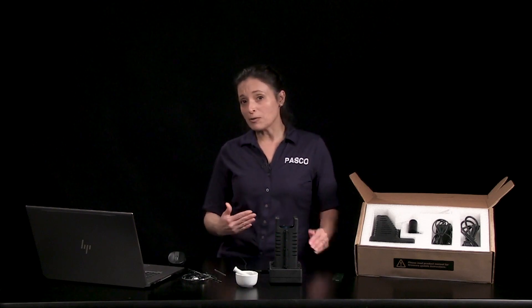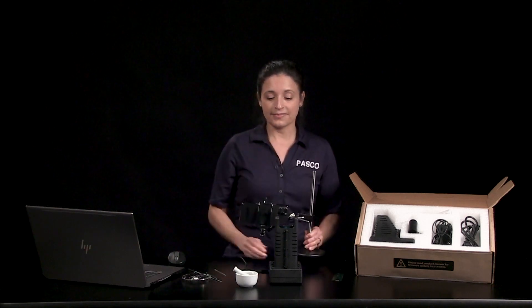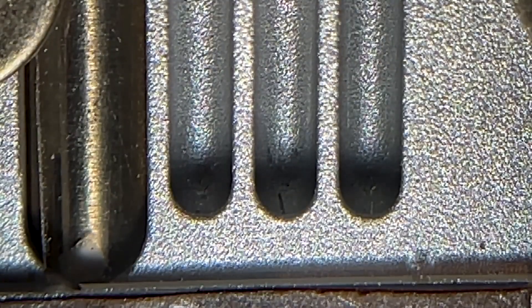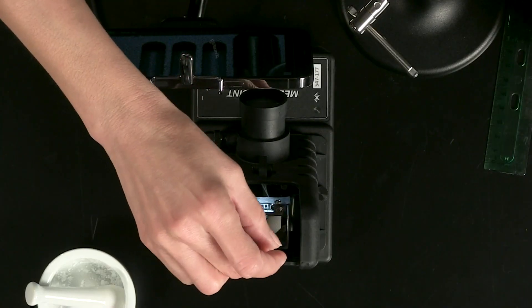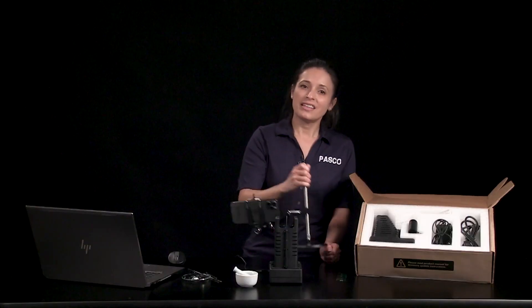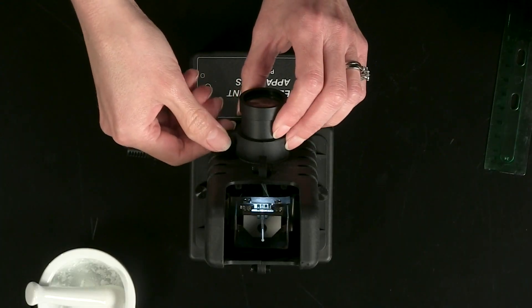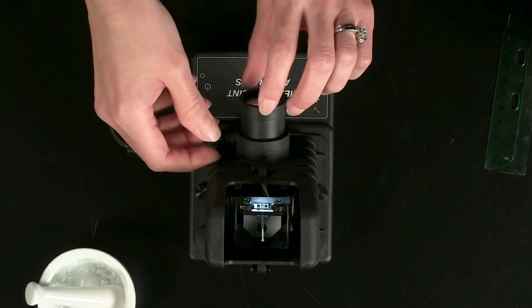I'll use a smartphone camera to give you a look through the eyepiece. As I set the sample tube in the chamber, you can see that you can test up to three samples at a time. You can manually focus the image by loosening the eyepiece using the thumbscrew, moving the eyepiece until the image is in focus, then re-tightening the thumbscrew.